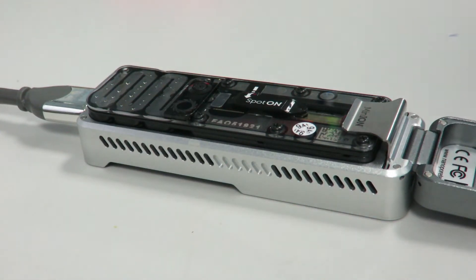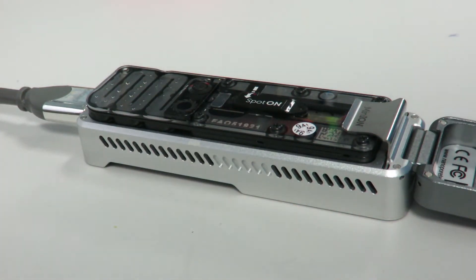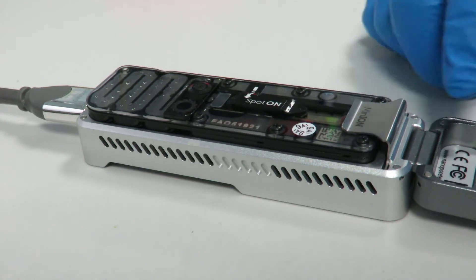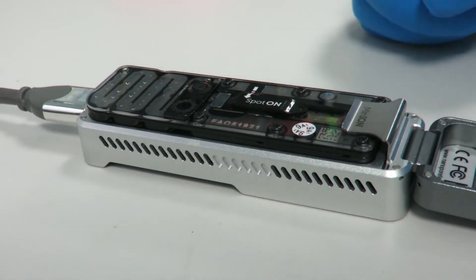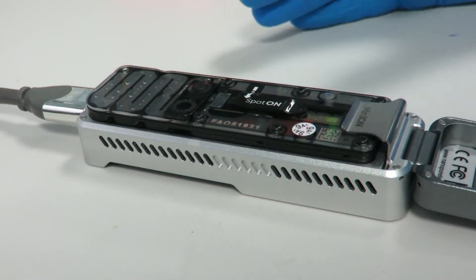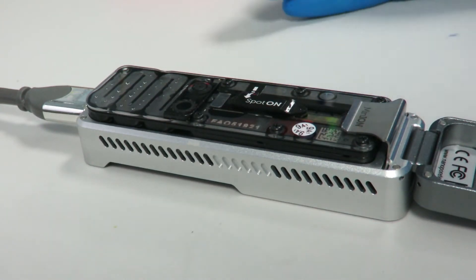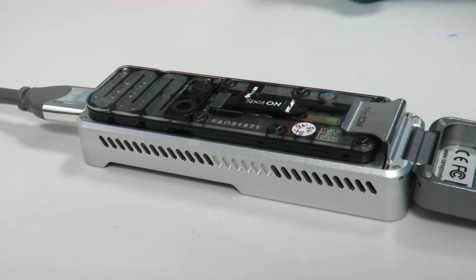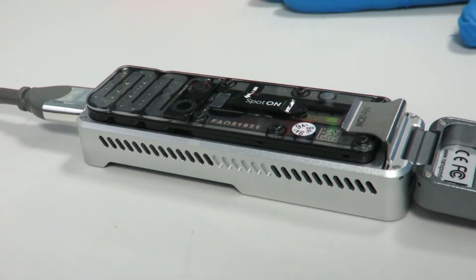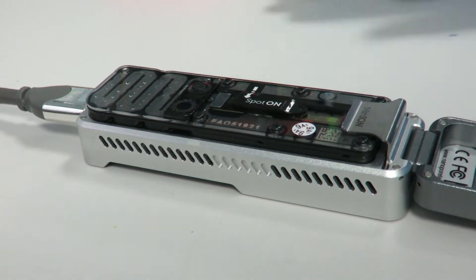Today we're going to go through how to wash the flow cell. Once you've run a sample on the flow cell — if you're only running it for a couple of hours, say just to identify what species you've got — there are going to be active pores left. What you can do is wash it and then add storage buffer back to it, which is the yellow stuff it comes in, and then you should be able to use it again.